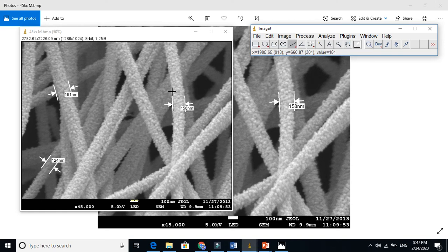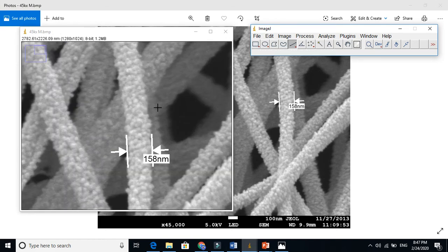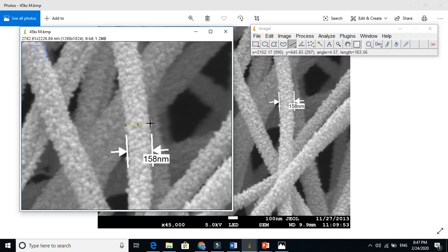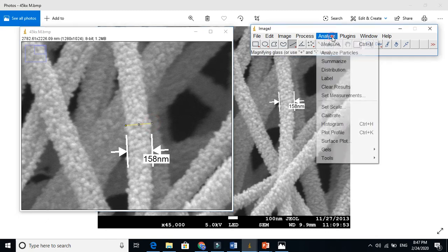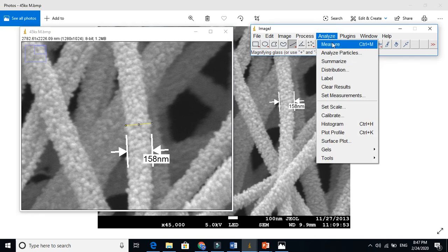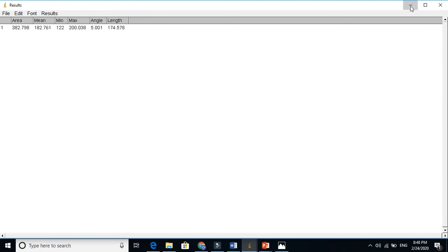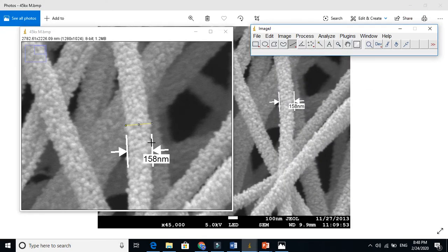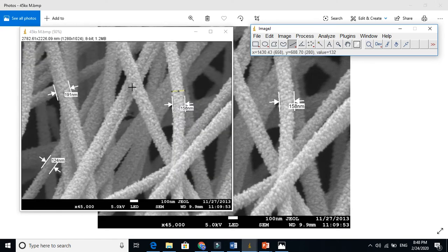Now let's find whether ImageJ gives the correct information or not. Maybe we will make a little mistake, but we try to get a good result. Let's measure from here to here — go to Analyze and click Measure. You can also press Control+M. This is 158. Let's see — 141.74. You see, so we maybe drew the line a little bit larger, but it is in nanometers, so it's almost okay. There is no problem.